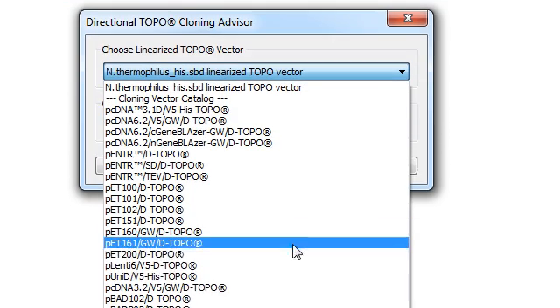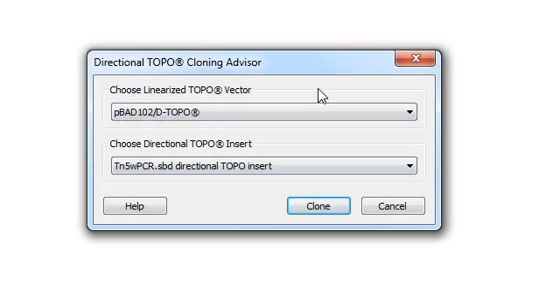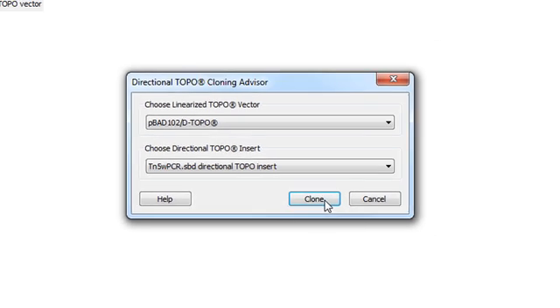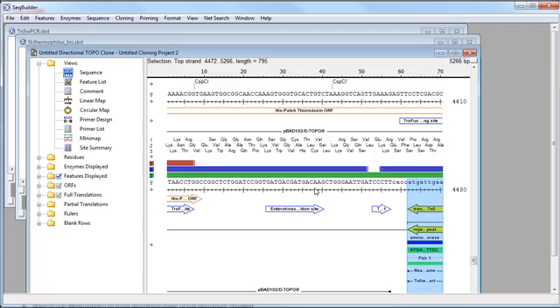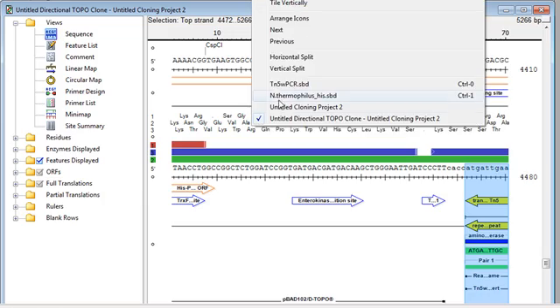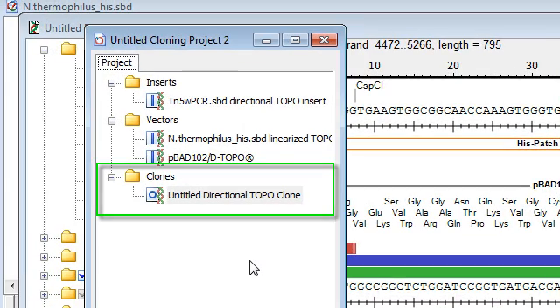So I'm going to go ahead and select a vector from the catalog, and then I can click the Clone button. And what that will do is combine the two sequences and create a TOPO clone. And that's automatically displayed here for me. And I can also now see that in the Clones folder of my project.